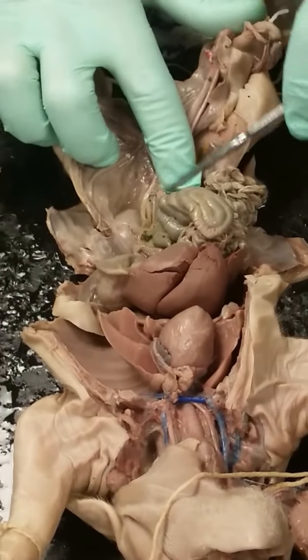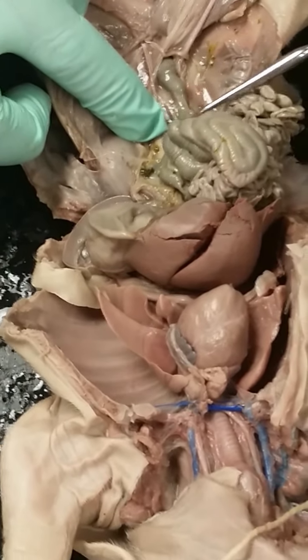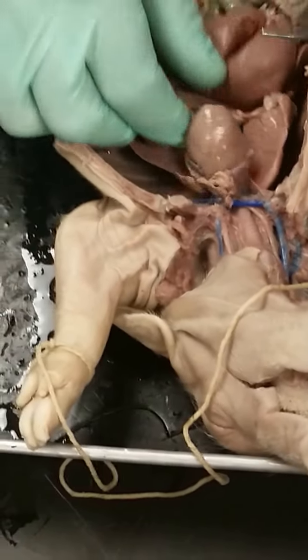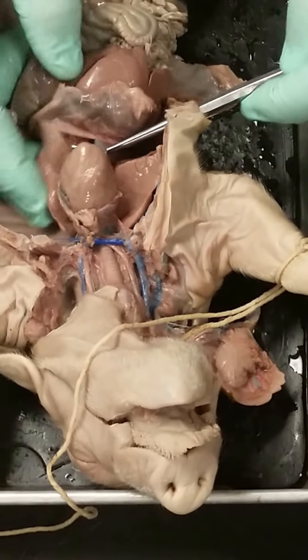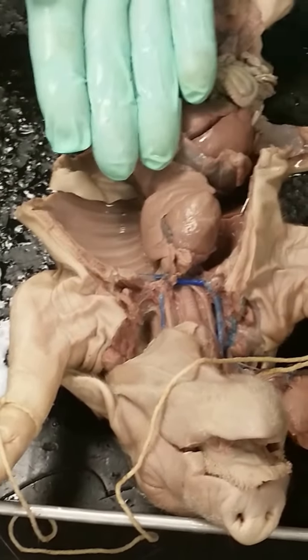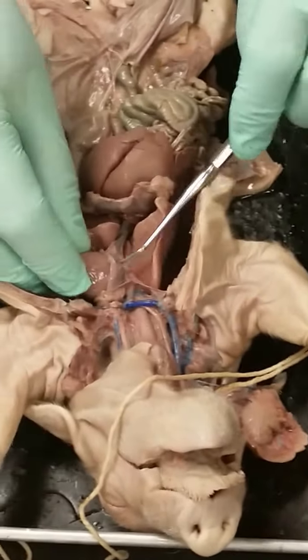The other thing that you can just barely make out is the vena cava. Here's the posterior vena cava. And you notice how they're running parallel, the abdominal aorta and the vena cava running parallel to each other. But when you get up here where the diaphragm is, notice how it's more centrally located, whereas the aorta is plastered right up against that posterior wall. So they kind of separate from each other as the blood goes back towards the atrium.